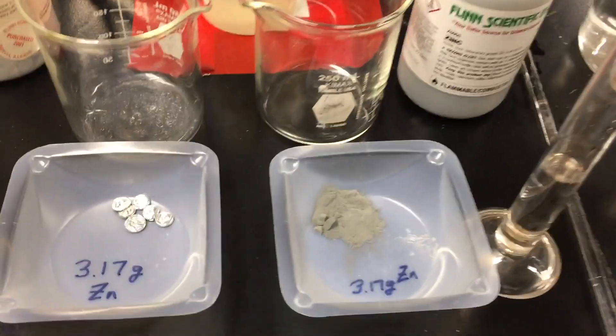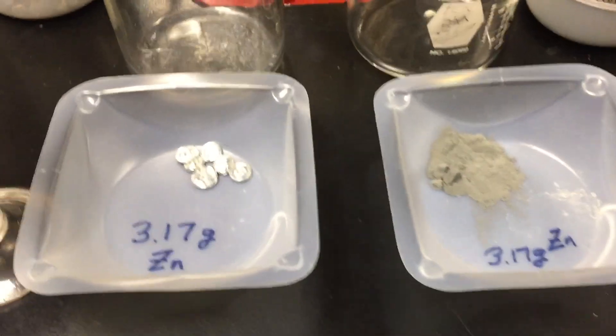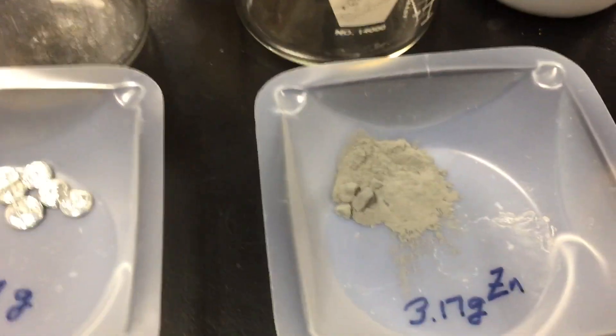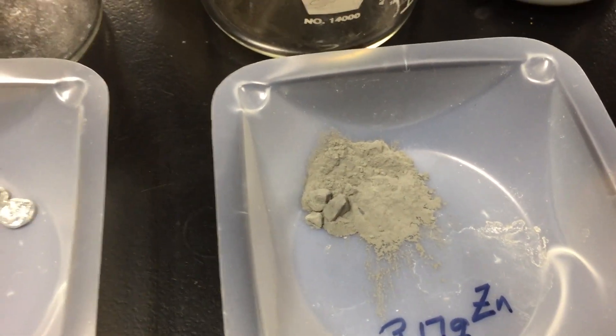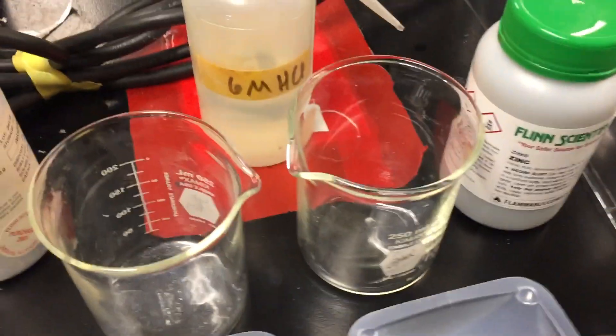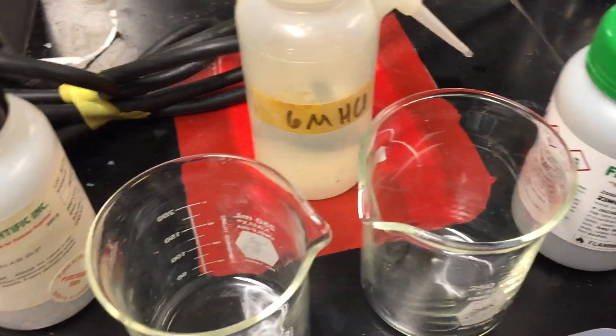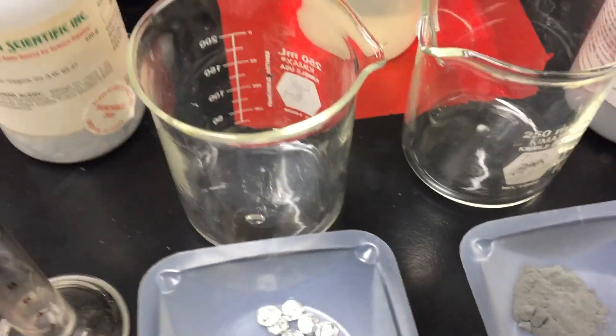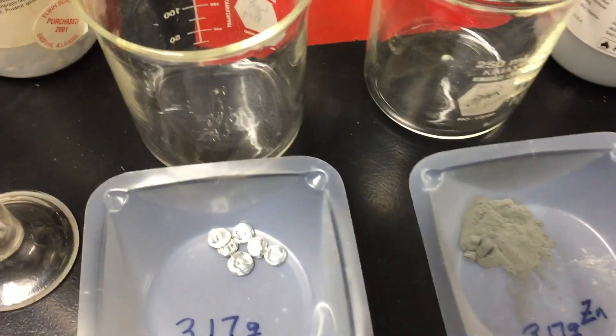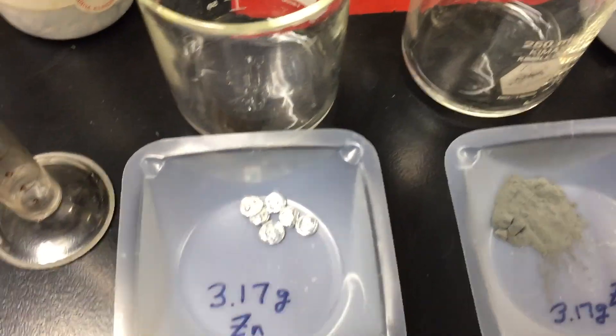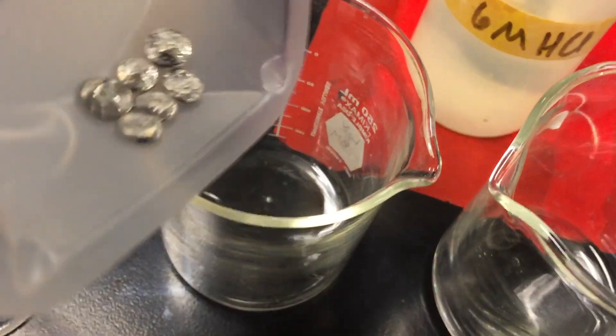Next up will be something called surface area. So in these two weighing boats, I have 3.17 grams of zinc ingots and 3.17 grams of zinc powder. Now to the beaker on the left, we'll be adding 10 milliliters of 6 molar hydrochloric acid, and also to the beaker to the right. So the hydrochloric acid concentration is the same and the volume is the same. Let's go ahead and see what happens when I add the ingots to the 6 molar.